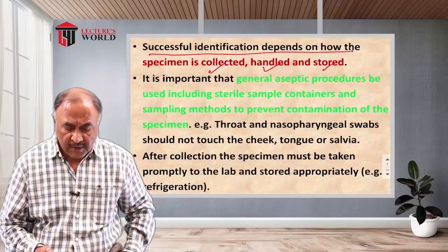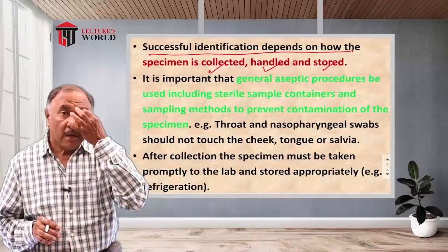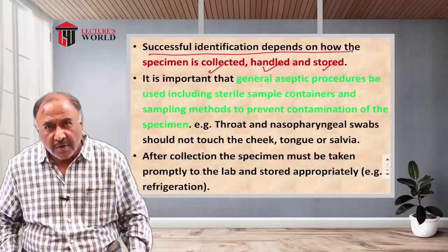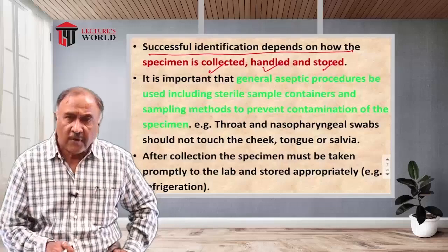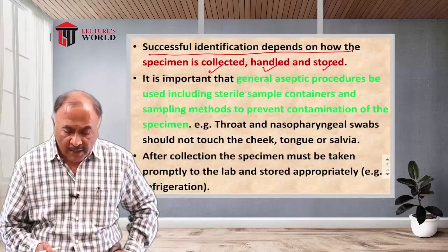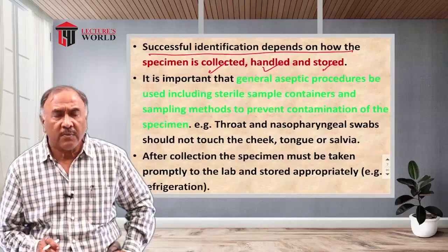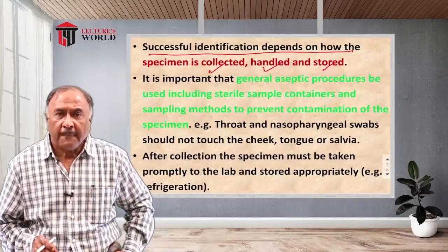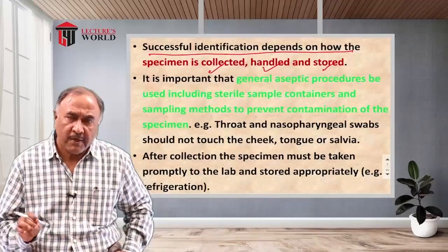Sputum is collected overnight, that is, first morning sputum is collected. It is treated with NaOH and then KOH and then centrifuged. The sediment is prepared for a slide and then stained by the acid-fast technique. Mycobacteria have a waxy cell wall that contains mycolic acid. It can retain the primary stain, Ziehl-Neelsen carbol fuchsin, pink in color.